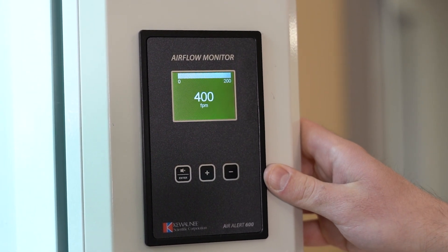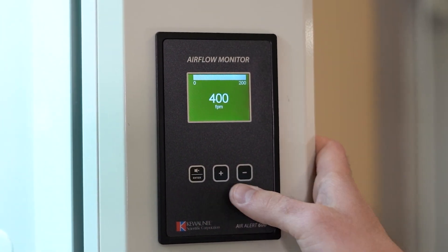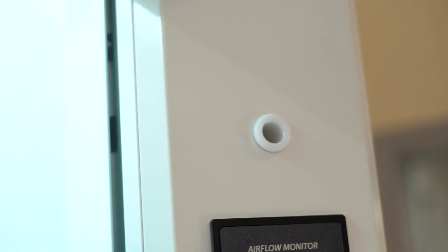The monitor consists of a color display, three control buttons, an inlet above the monitor, and a sensor inside the hood sidewall. This sensor allows the monitor to read the velocity.